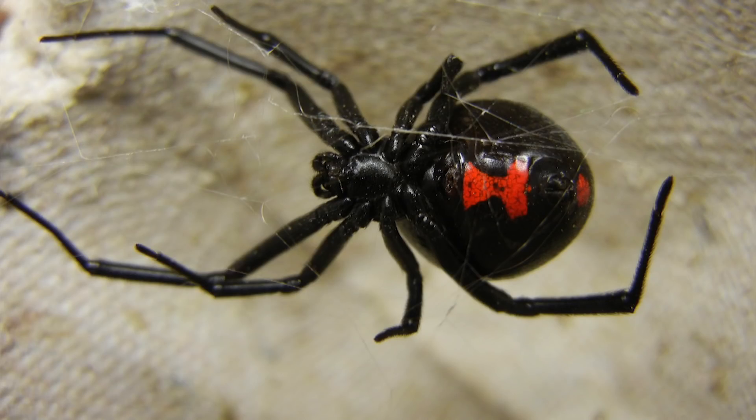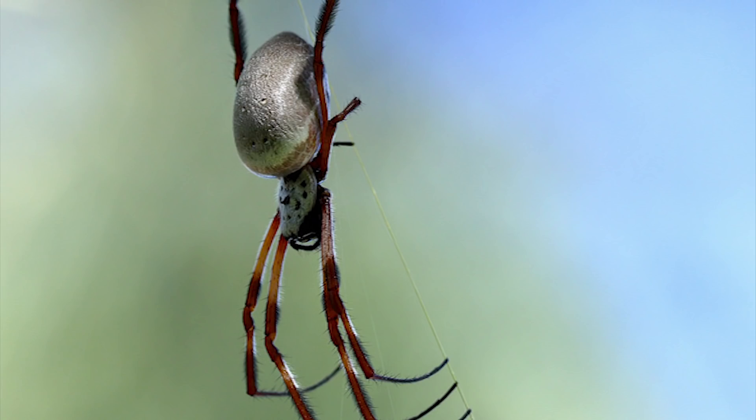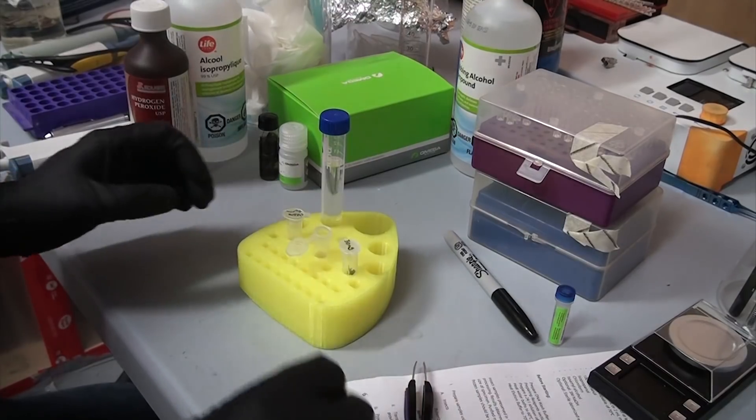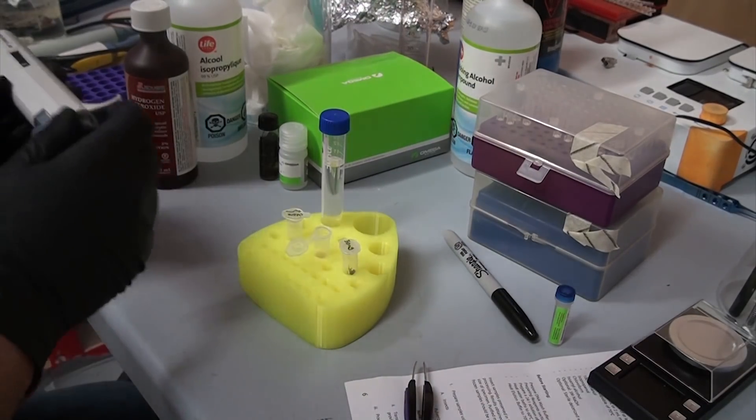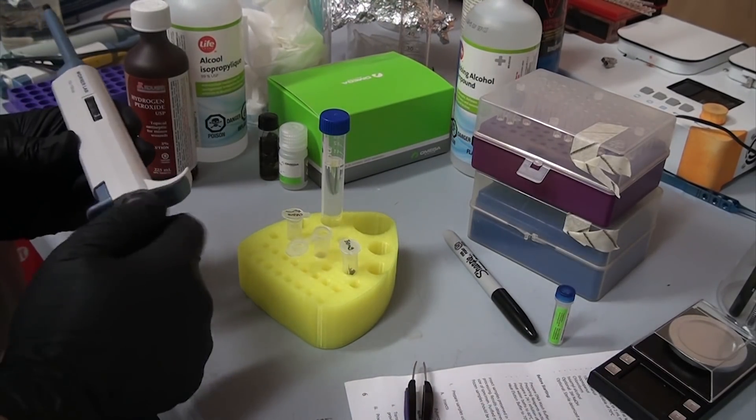So now I'm looking to source fresher spiders. I've already got a few leads, so hopefully some of them will turn out. As a last resort, we may switch to another spider species because they're easier to get, but for now I want to see if we can get the widows to work. At least now we know that this kit works, so as soon as we have a fresher specimen we can definitely move forward.